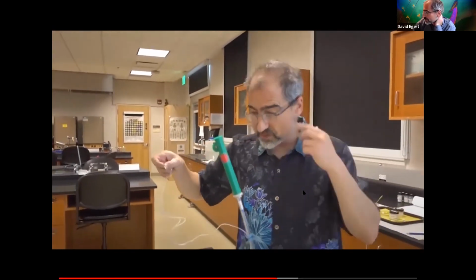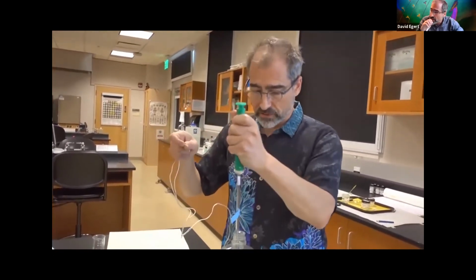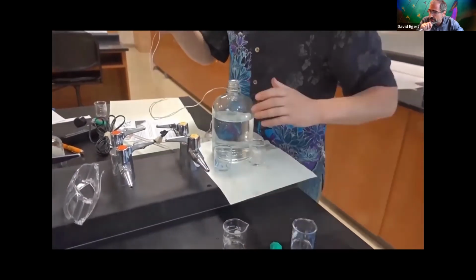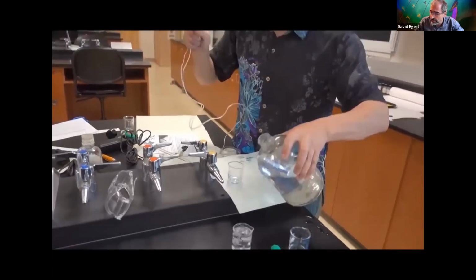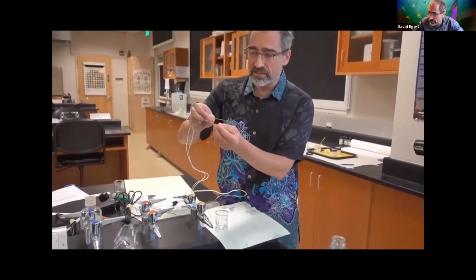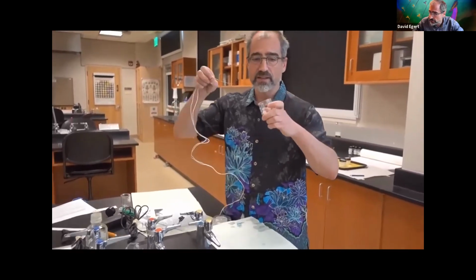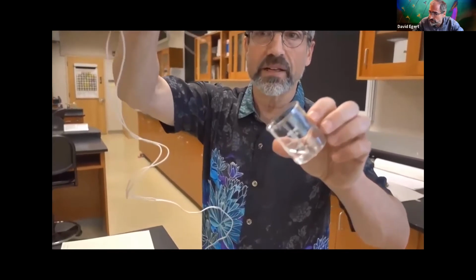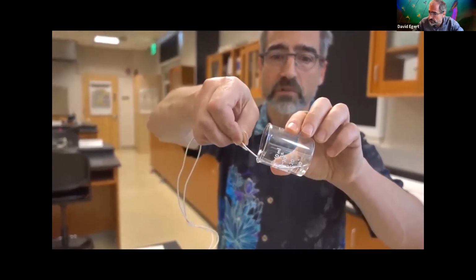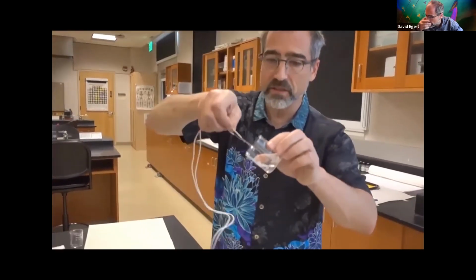I can rinse these little guys off with some distilled water, because I want to make sure I'm not cross-contaminating stuff. And normally I would just have a little beaker like that. So I'm cleaning these off. Now I'm going to go into my sodium chloride. And again, same thing. Air, there's no electrical current. I'm going to submerge them in the sodium chloride. I don't know if you can hear that. I definitely think you can hear the little buzz go.